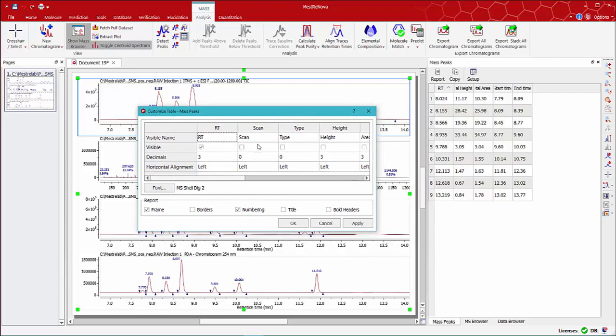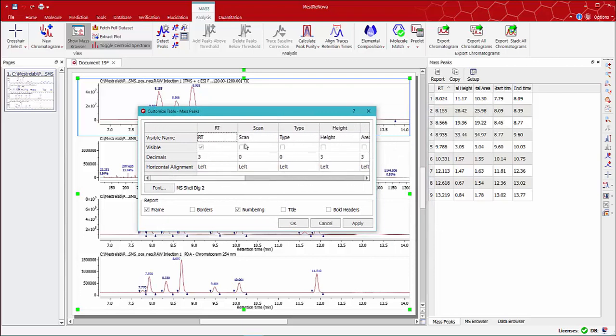If you click on Setup, you can also choose which parameters you want on the table, change the number of decimal places, etc.